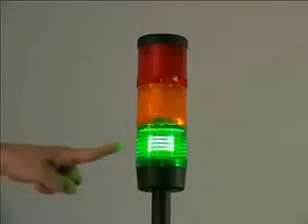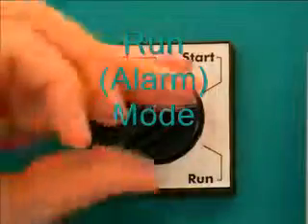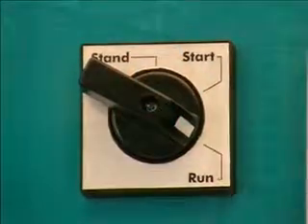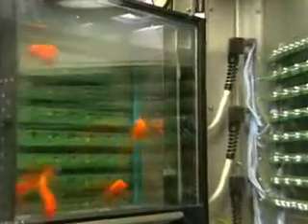Normal working conditions are shown by the green traffic light on the top of the instrument. Due to natural variations in fish behaviour, alarm criteria may be reached from time to time simply by accident. In the event of values falling below a given threshold for a period of time, the instrument automatically initiates the alarm verification process. This is performed by decreasing and then increasing the illumination in the aquarium. Normally, this leads to a dramatic increase in the activity of the fish. Under toxic conditions, however, this may not occur. Thus, the instrument rejects or confirms the alarm automatically.